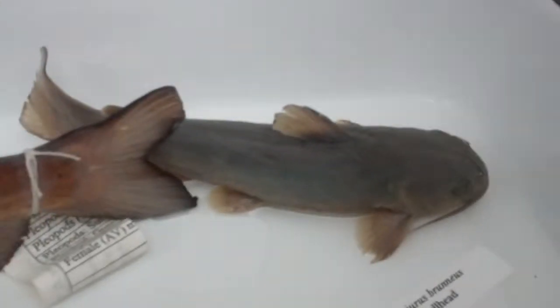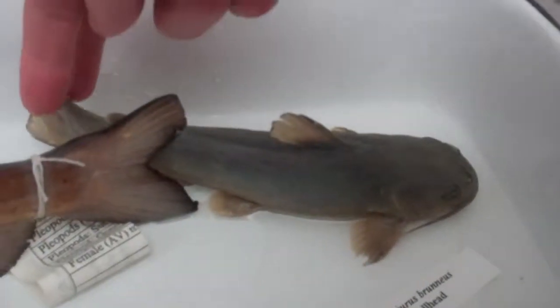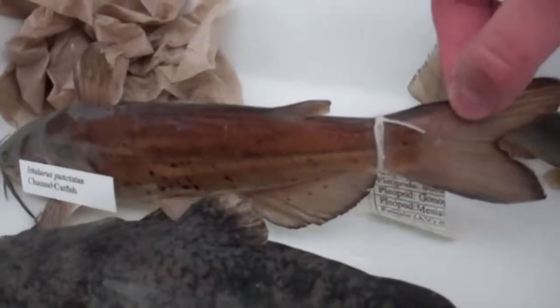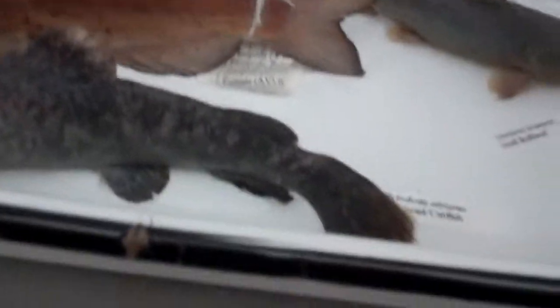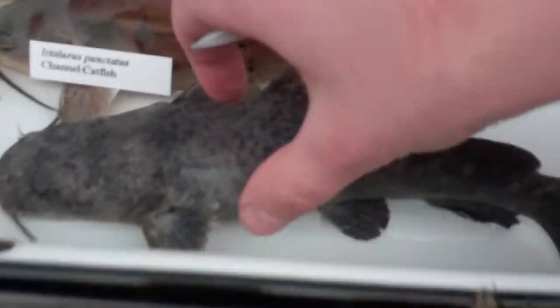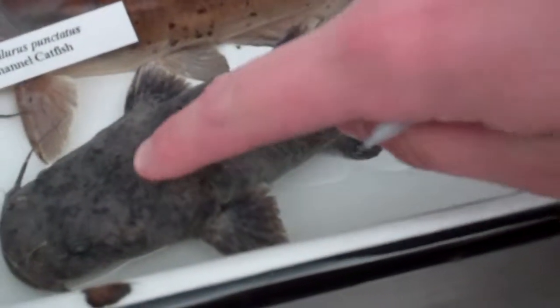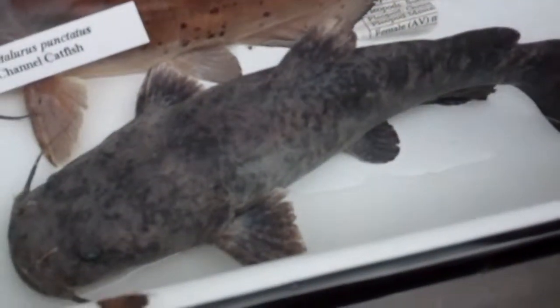Alright guys, tell us the difference between these — how do you tell them apart? Family Ictaluridae. The snail bullhead doesn't have a fork tail — he has a flat tail. The channel catfish has a fork tail. Both the snail bullhead and channel catfish have sub-terminal mouths, and the flathead has a terminal mouth right in front. Super flat head, like a tube — really square.